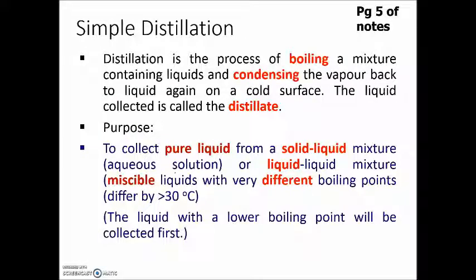So, distillation, just to recap, is the process of boiling a mixture or evaporating a mixture containing liquids and condensing the vapor back. Now, the thing that condenses is called the distillate. So not filtrate, but distillate, because it's a liquid that condenses.